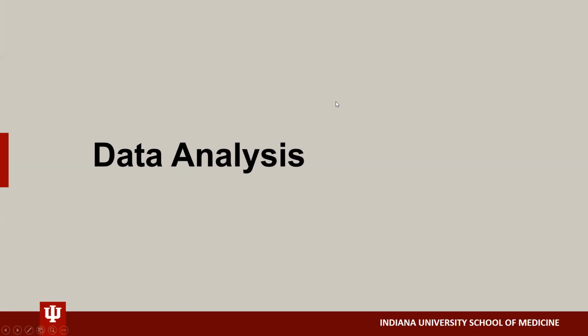So I'm going to walk you through how we create Scaffold files to send and share with viewers. I recommend you start off with some of the other modules in this segment, and specifically Proteome Discoverer, because that's generally where we're doing our deeper data analysis, running the search engine and doing FDR cutoffs.